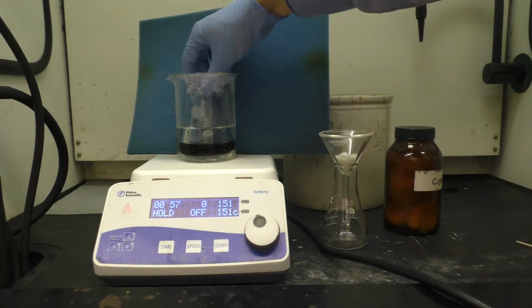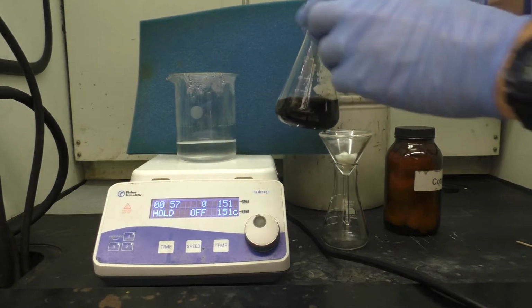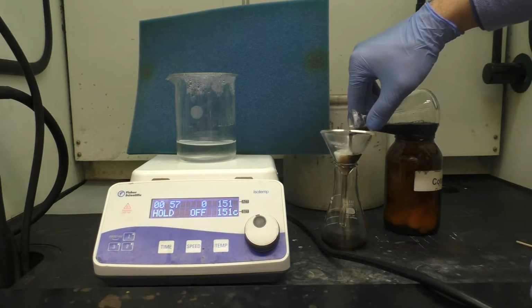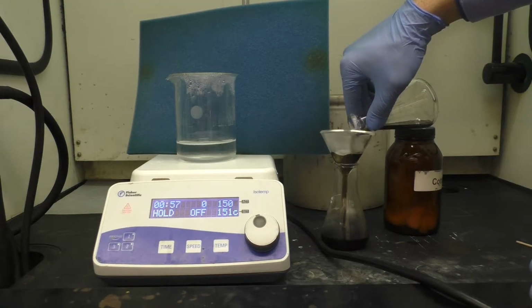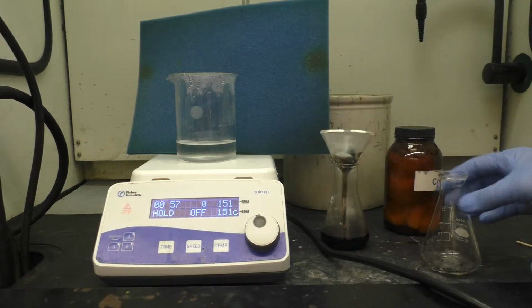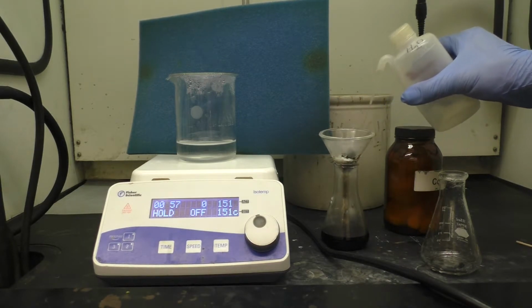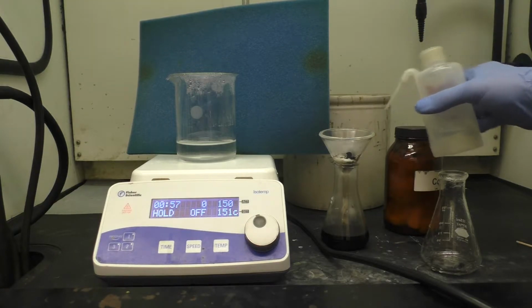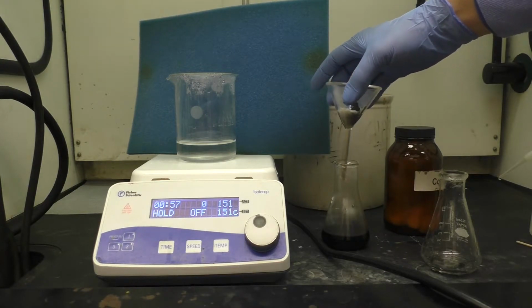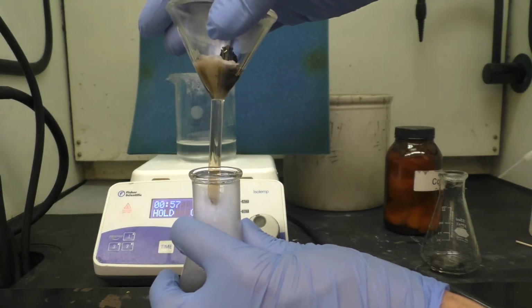And then I'll bring out my solution here. It's very black, as you can see. I'm just going to carefully pour this onto the filter. Sort of rinse that with some distilled water. The color of the solution in the funnel itself is not that dark.